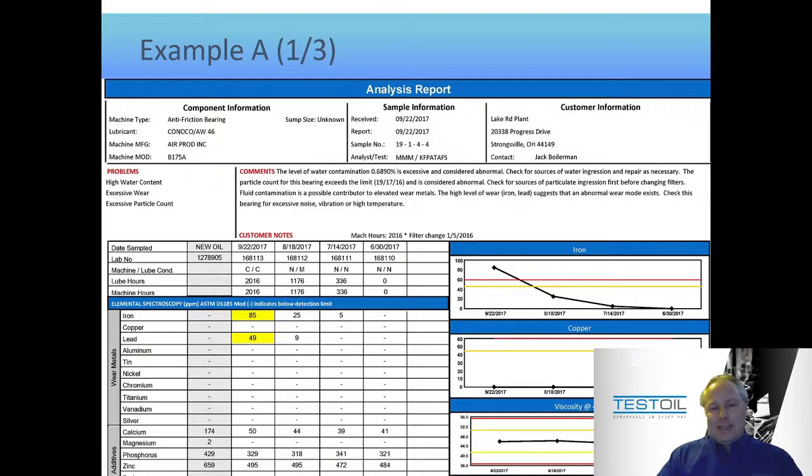So again, what does that tell me about the trends I should expect to find? I should not expect the trends to ever change direction, right? Because when you change the oil, certain things improve. So certain numbers go down, certain numbers come up. In this case, I should expect all numbers to move in one direction and one direction only. And, like I said, I should expect a smaller change between the first and second samples versus the second and third and the third and the fourth. So this is why we read the whole report, because it's going to help with our interpretation.